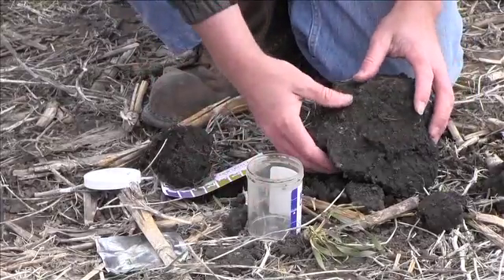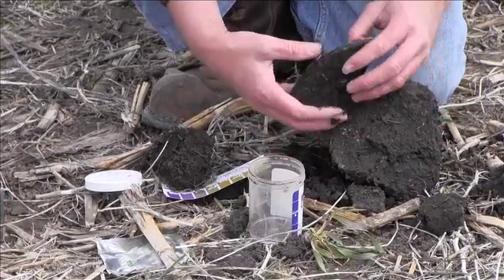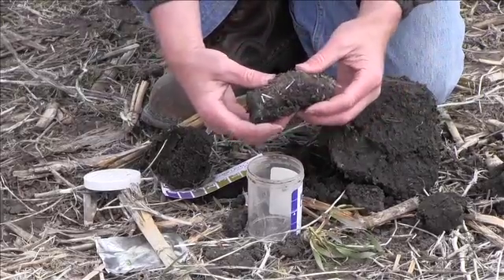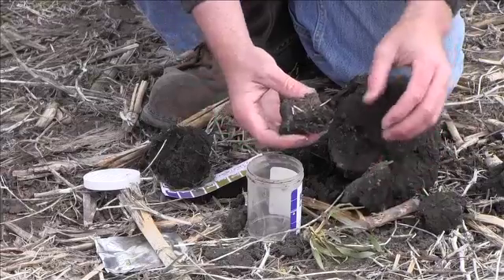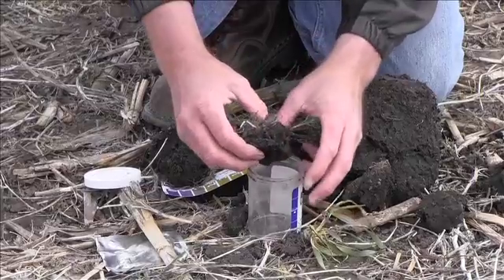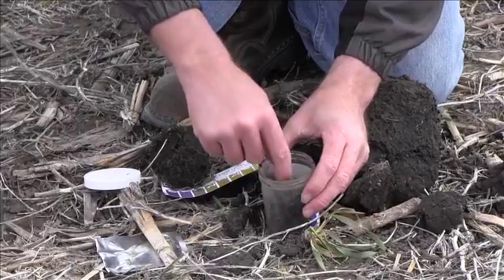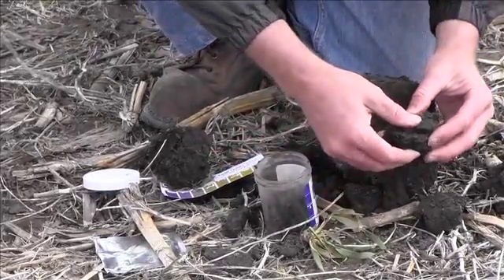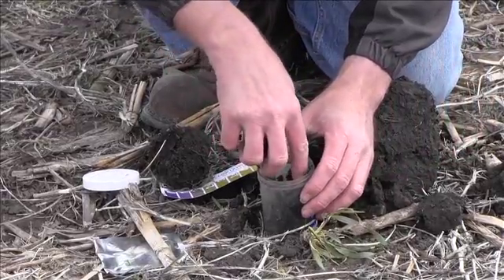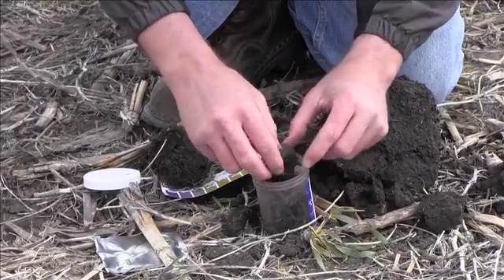Take some soil and gently break it apart and put it into that jar up to the fill line. Try not to disturb the soil — the less disturbance the better — because otherwise you're acting like false tillage and that will have an effect on what your respiration will be from this jar. Just place that soil in there lightly and gently.